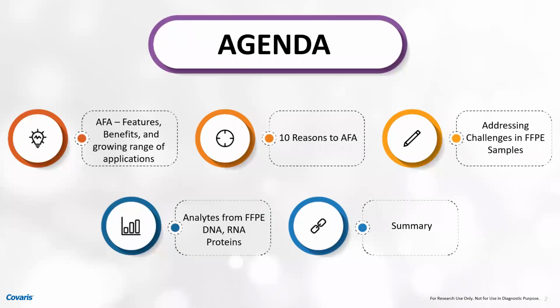So first and foremost, how many of you, I know at least one, but how many of you are aware of AFA or this technology? 1, 2, okay. The less, the better, because then my slides are justified, right? So I'm going to introduce AFA and highlight why this technology is better than what is typically used by most people.